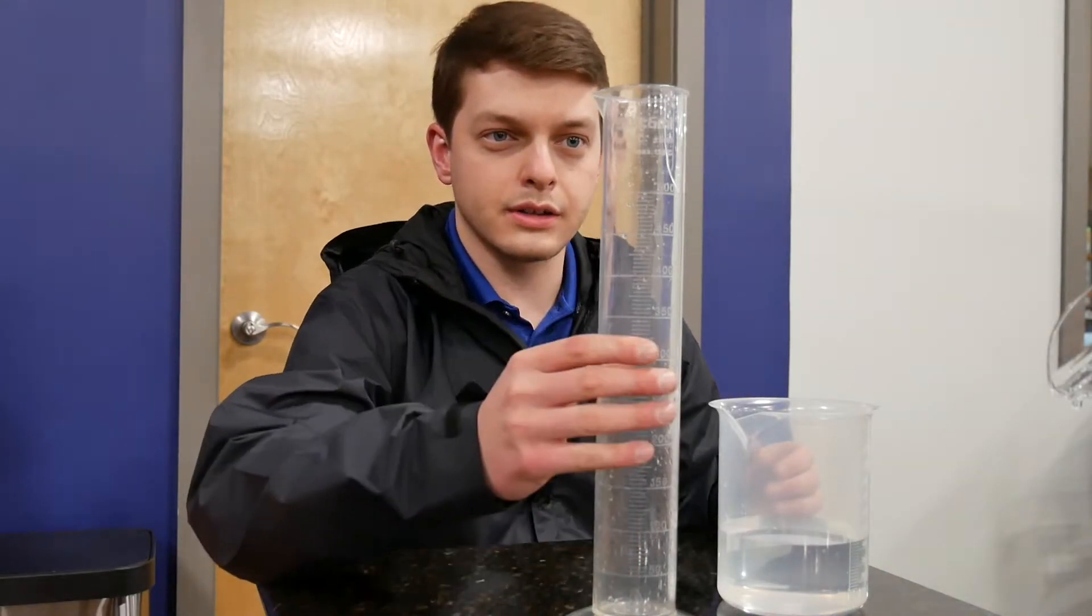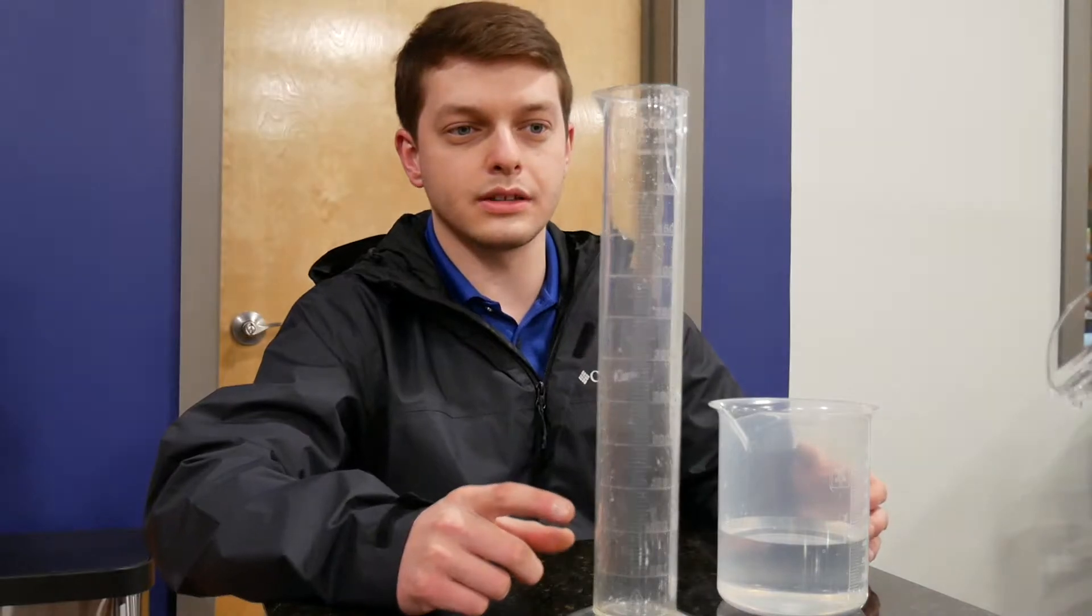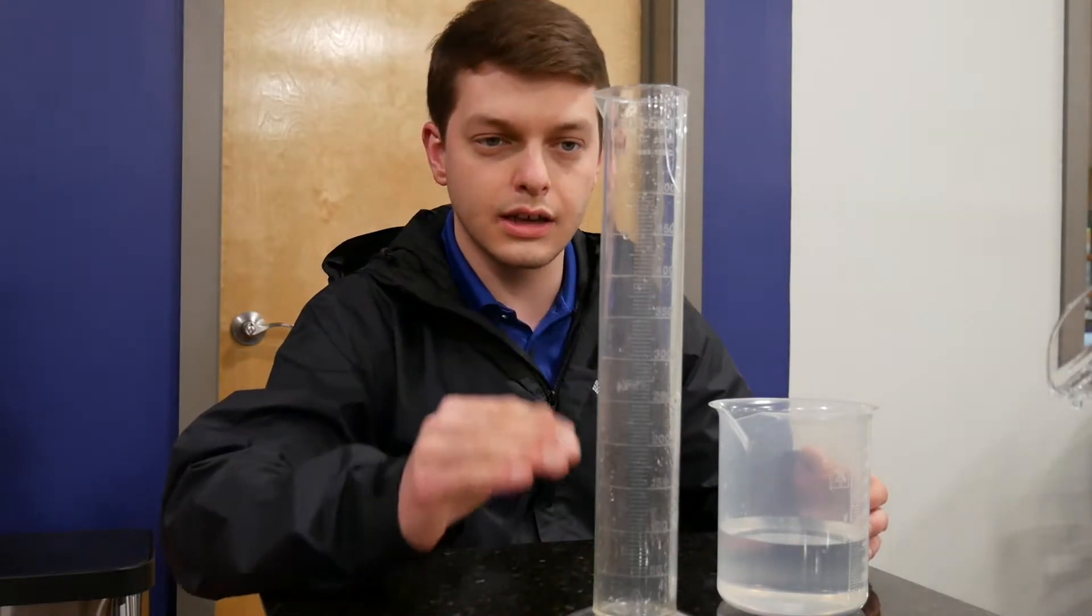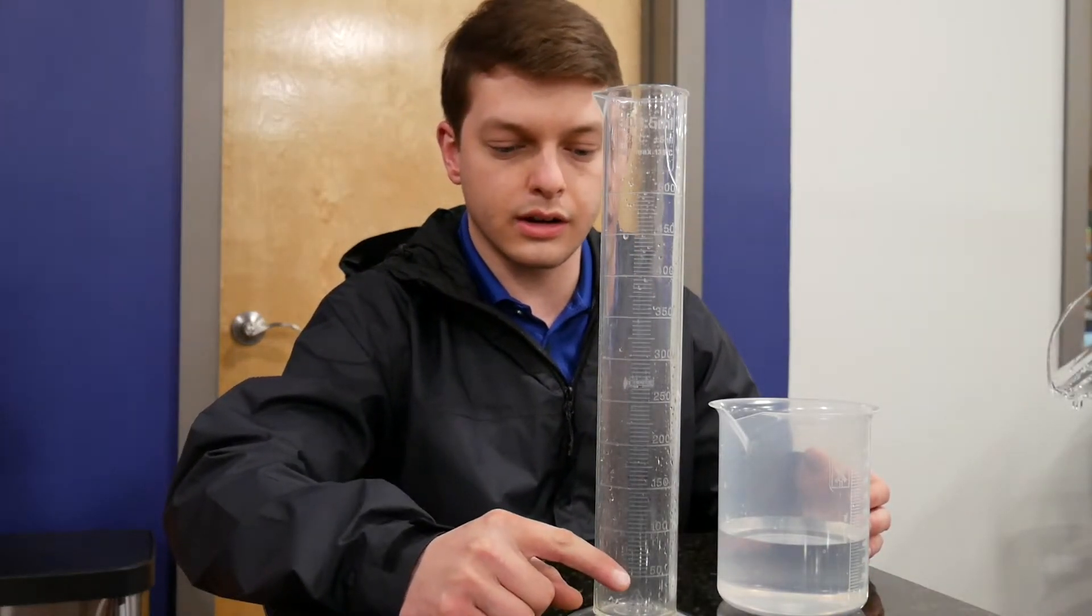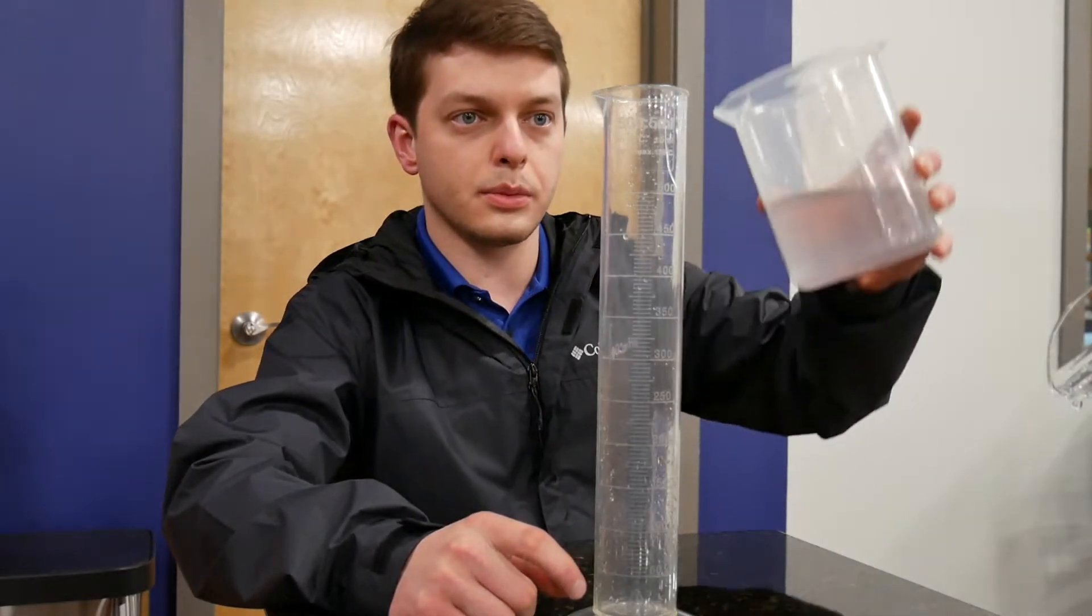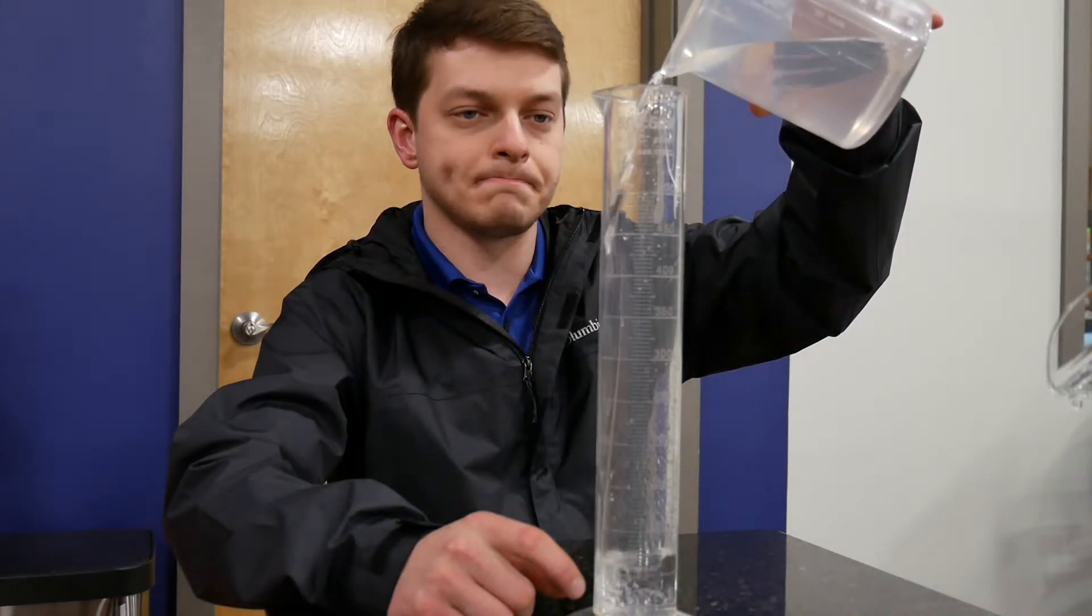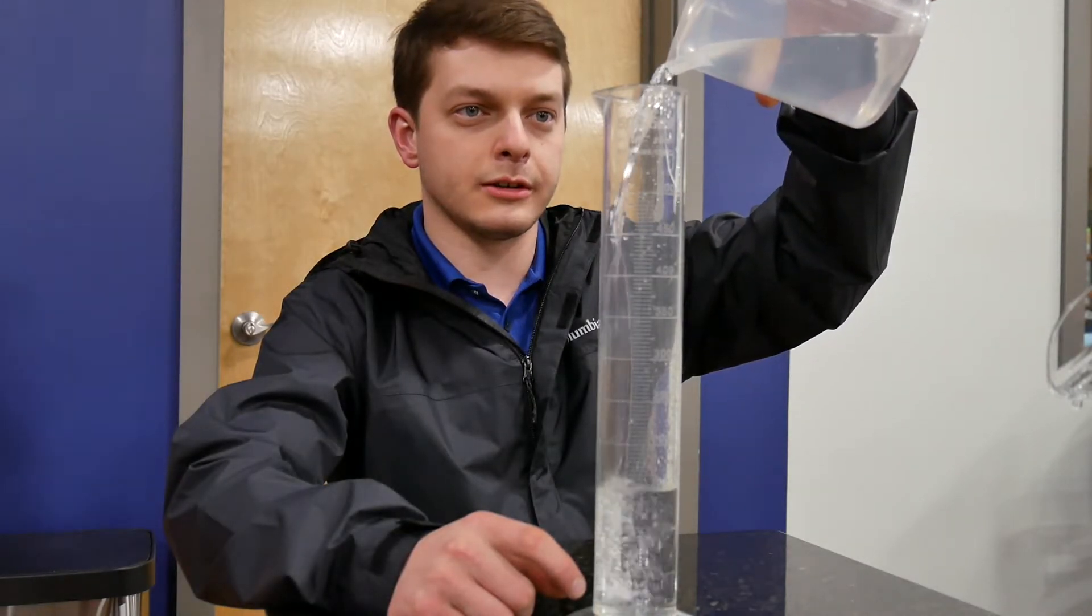Okay guys, so we have our graduated cylinder here and we have our beaker of water here. With this graduated cylinder, it measures in milliliters and each tick mark is in five milliliter increments. So I'm going to go ahead and slowly pour the water from the beaker into the cylinder, then we'll read it.